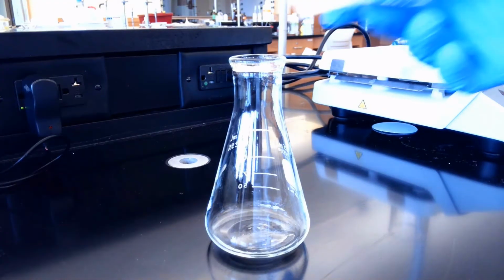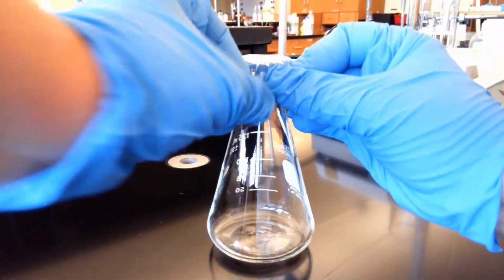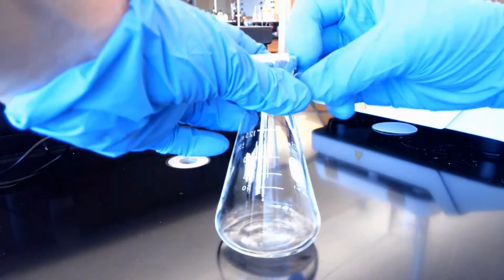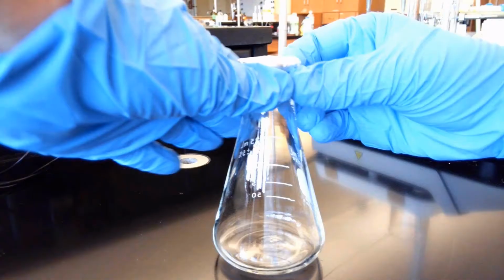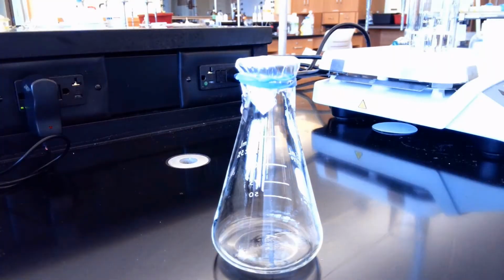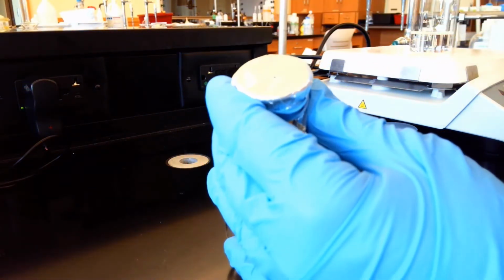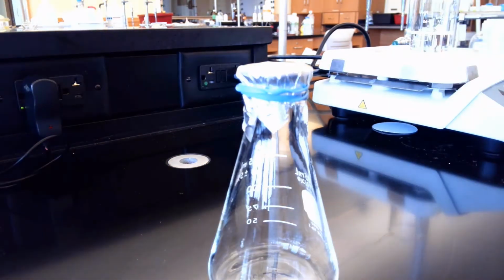We're going to secure the top with our aluminum foil all around so it's sealed. And then we'll put on our rubber band as well. And then the last thing that we have to do is we're going to poke a hole on the top. So right here, a pinhole. And now we're going to heat this in our water bath.